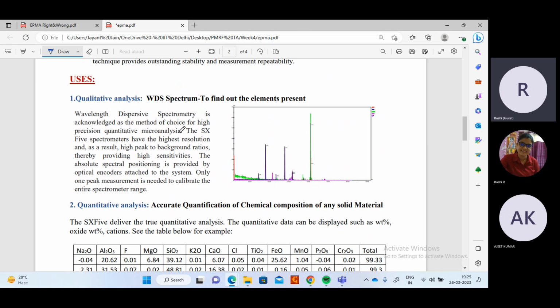You have to tell what you are interested in, only particular elements like iron, carbon, manganese, magnesium, only these elements, and then it will cover up to 100%, and tell within 100% how much of this is present. Okay, you got the point, the difference.